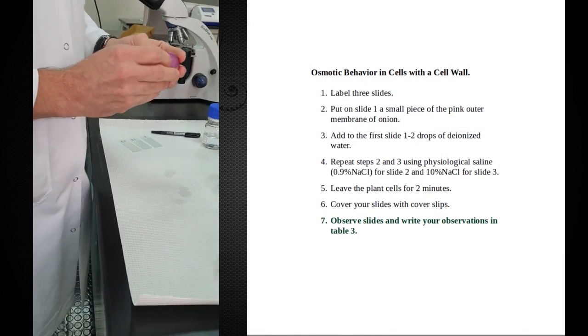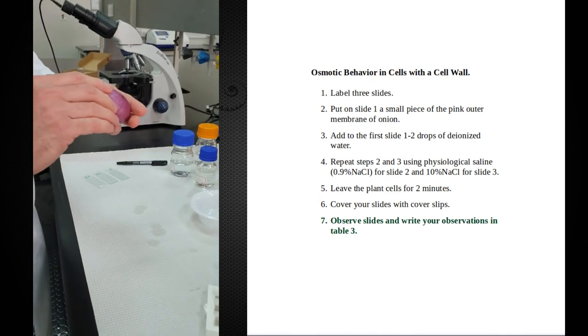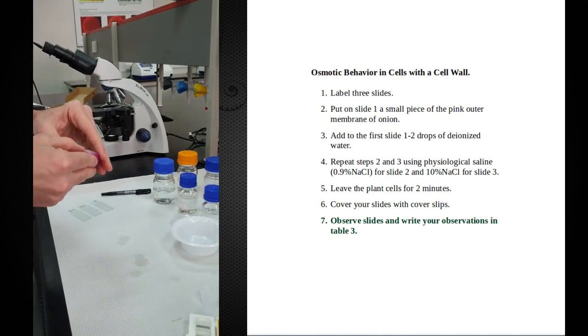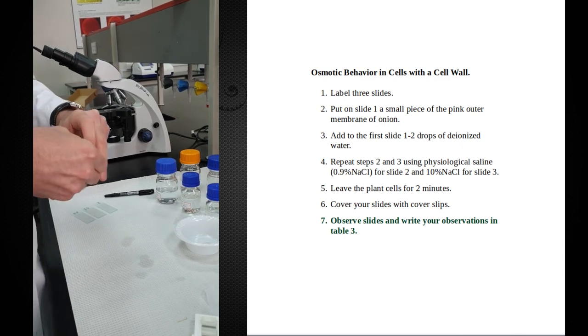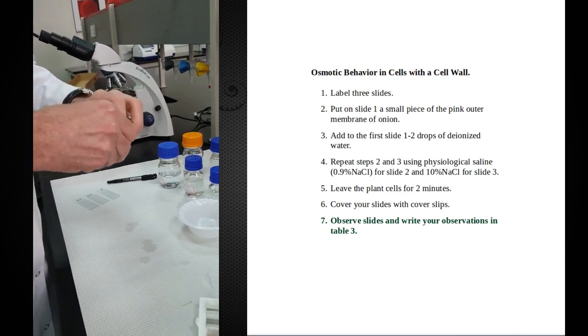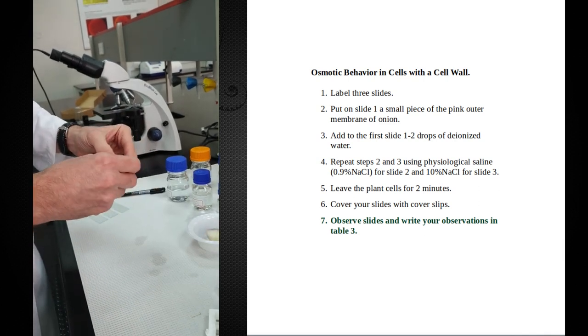Okay, so what we're going to do next is prepare some slides using this red onion. Now what I like to do is use the reddest part of the onion that I can. It's usually the outermost layer, so I'll just take this thing apart.